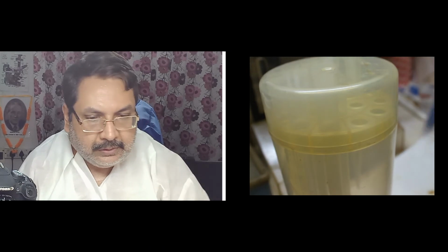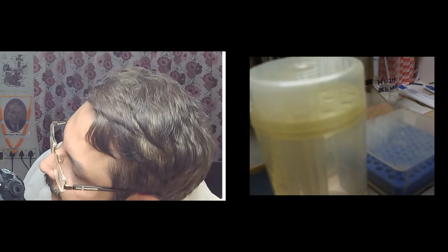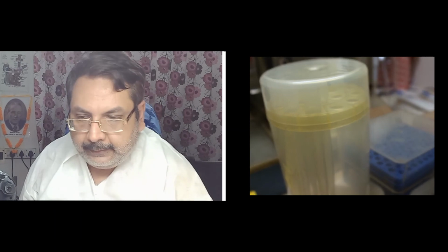One tip is for the 5 ml auto pipette. Another tip is for the 1 ml auto pipette, 1000 micro ml, and another one is up to 200 micro ml auto pipette. So these 3 types of tips are generally used, as the camera is showing. When I move the camera towards it, you can see this is the 200 micro ml tip, this is the 1000 micro ml tip, and this is the 5000 micro ml, or 5 ml auto pipette tip. So these 3 types of tips are generally used in the microbiology lab.